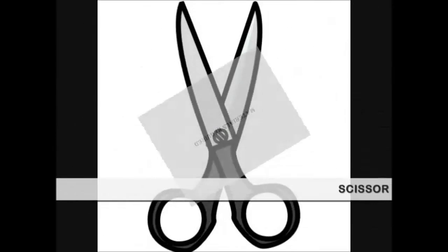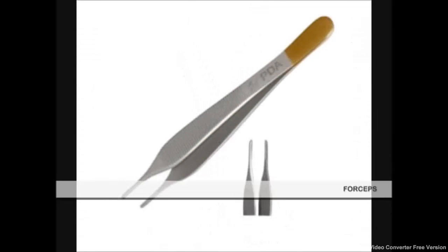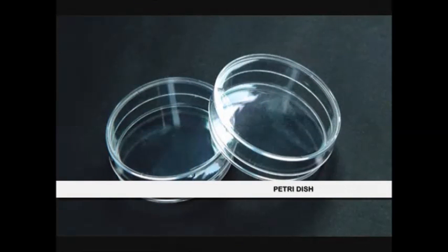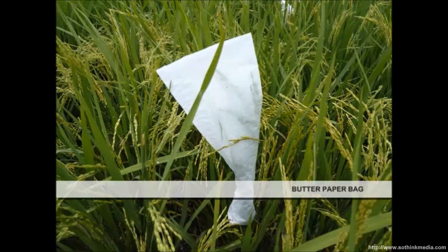Materials required: scissor, forceps, petri dish, butter paper bag, and thread.